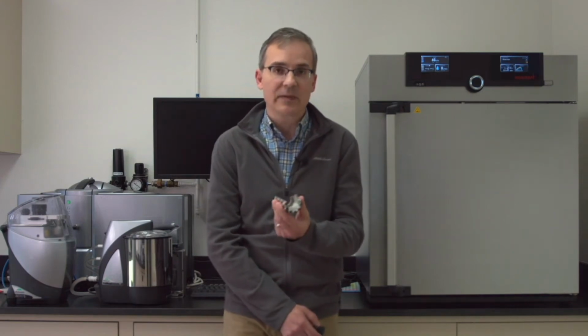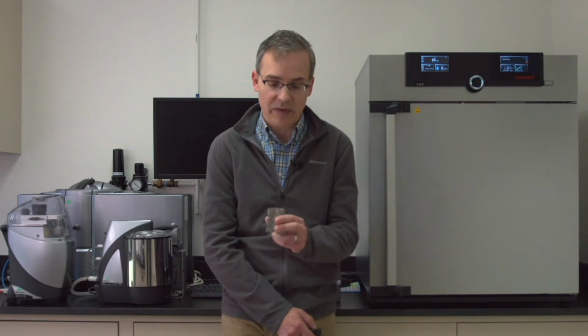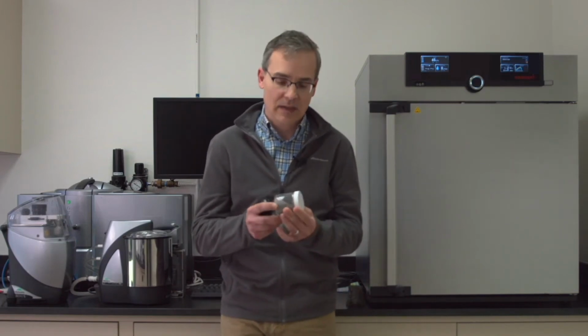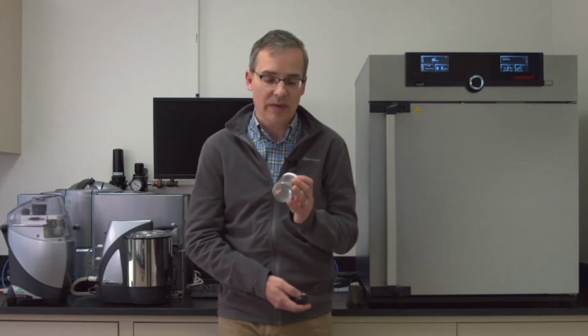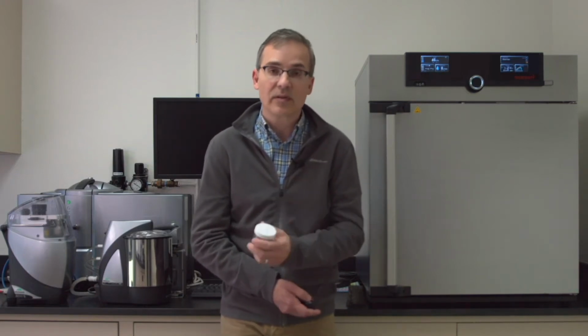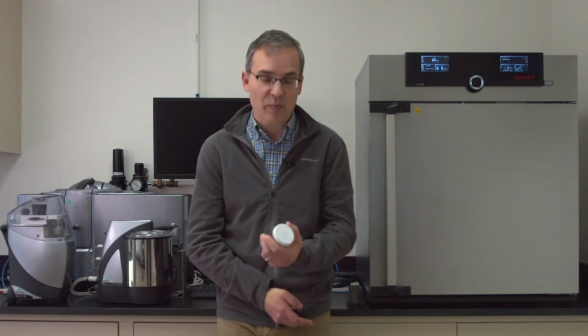So in talking about the different types of additive manufacturing processes for metals, what I'm focusing on today are the powder-based processes. Example is laser powder bed fusion that was used to produce this part. And these processes are quite a bit different from conventional powder metallurgical processes. The testing involved is twofold. One is testing the metal powders themselves. So these metal powders are very specialized with unique properties for 3D printing. And they are either raw materials used in the printing or in-process materials or recycled materials used during the printing process.